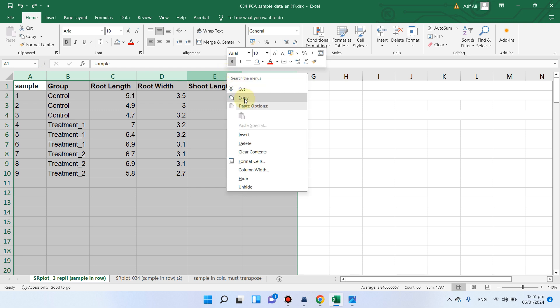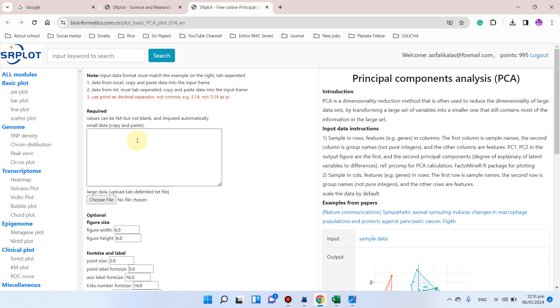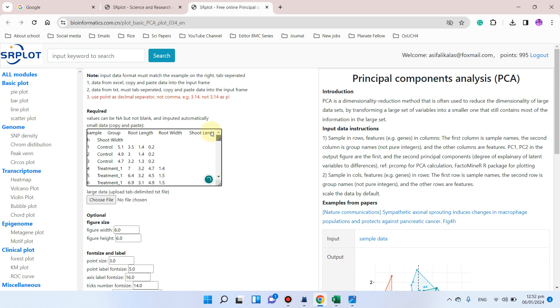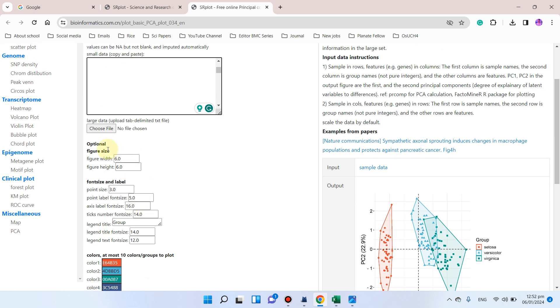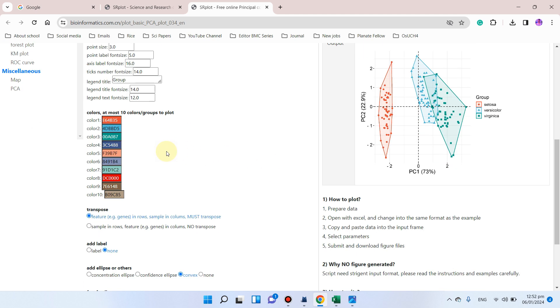I will copy all this data and go back to the srplot website and paste it here. You can see the values have been pasted. From here you can select the figure size, the font size, and what to write as the legend title — in this case we just want the group names.